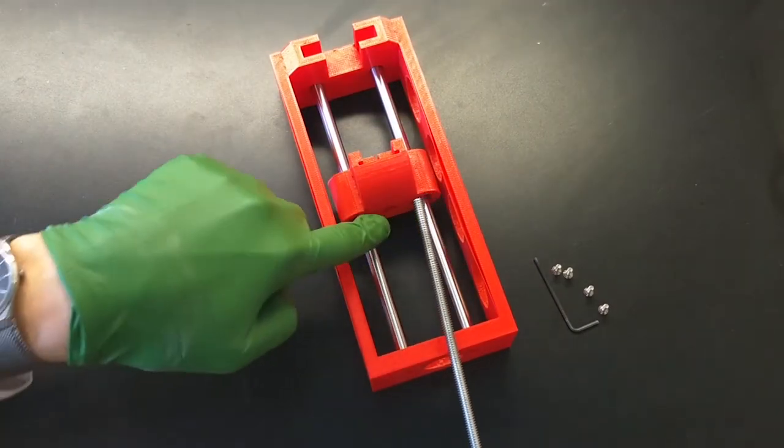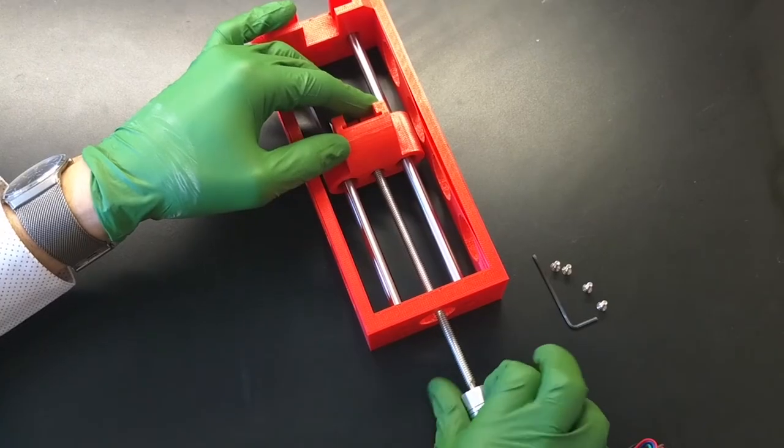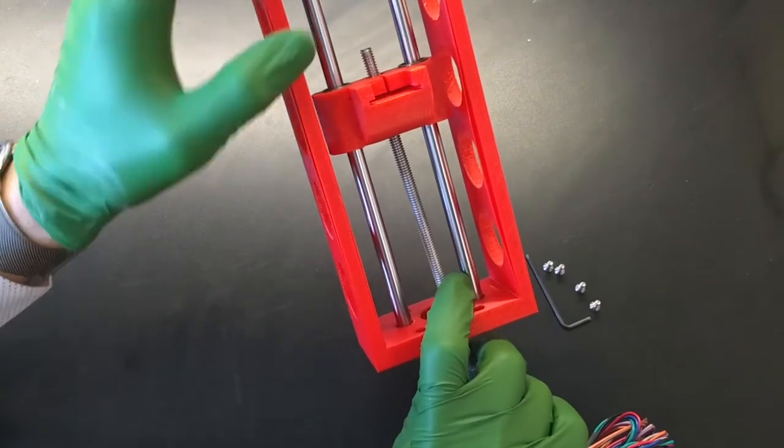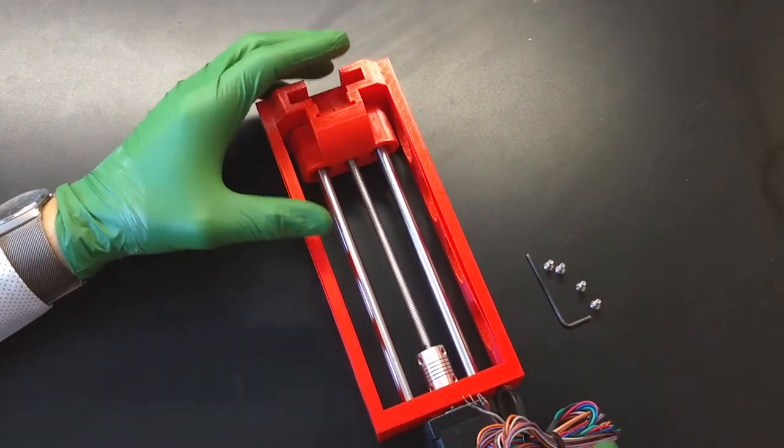Thread the rod through the hex nut inside of the push block. Make sure to extend it a few centimeters through the other end so that the motor can mate to the rear face of the chassis.